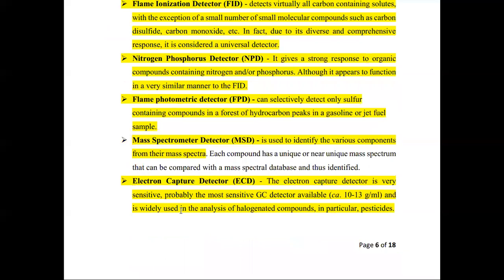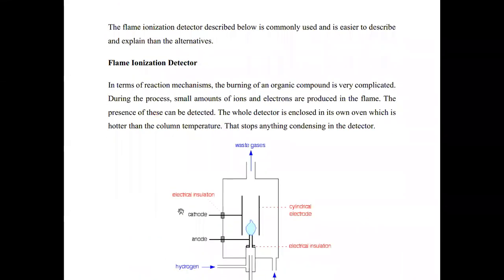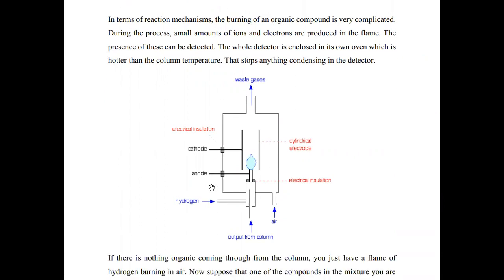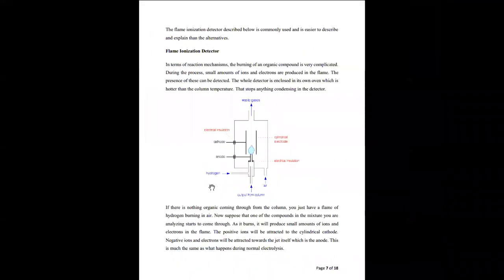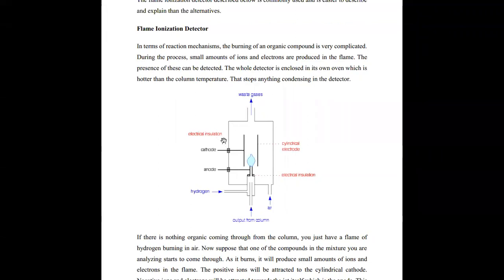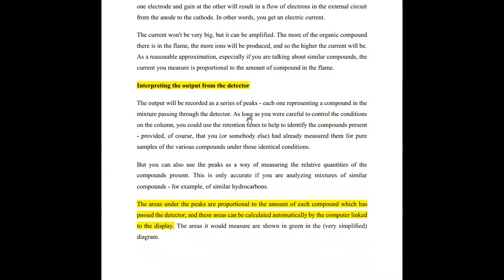Then those are things. So closed, you can have the flame ionization, we've got nitrogen, we have the mass spectrometric detector, we have electron capture, and then we have flame photometry. Now, these are some of the things that I think are just for the sake of understanding. That's why I didn't even highlight them. This is how it's done, the detector, but I think it's not important.